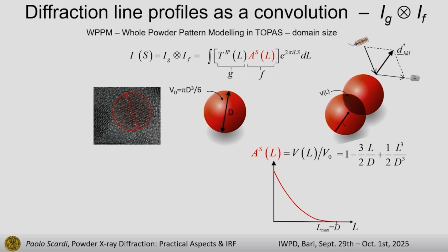So it turns out, we kind of demonstrated this, I think, that it is always a polynomial as far as you have polyhedra. So if you have polyhedral crystals and spheres, the common volume, that's the way we call it, is always a cubic. So it is just a matter to find the coefficients of this third degree polynomial. Geometry, easy.